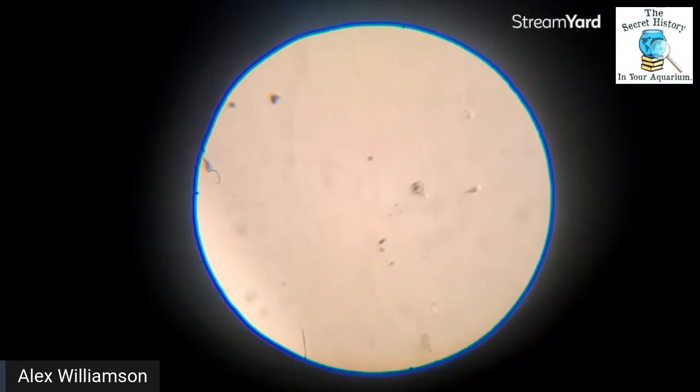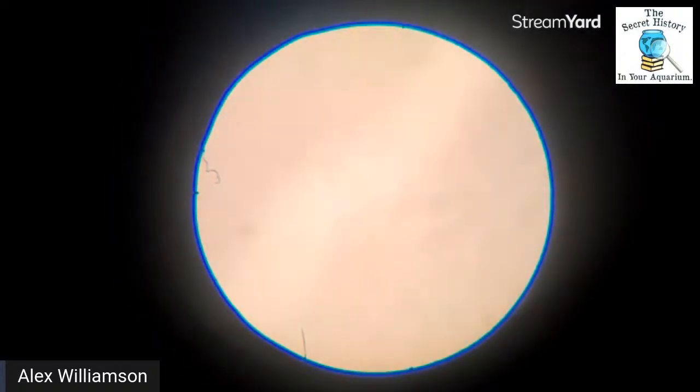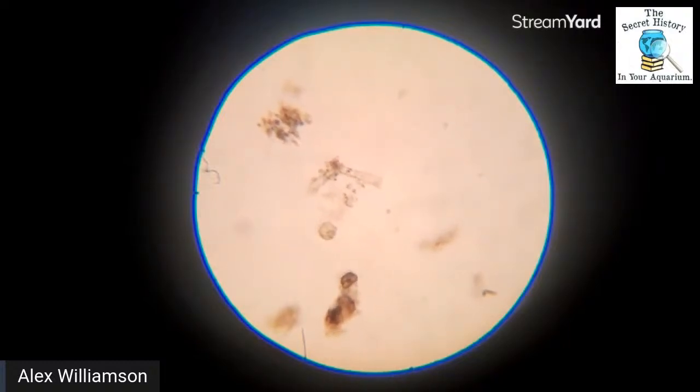If not, they could just also be shocked right now under the microscope light. But we can see here that there's two right center. I don't know what they are off the top of my head, and don't ask me the species. Oh, here we go. Here's something. I see eggs or something going on. Where'd it go? All right. Bear with me now. We're getting there. There we go.